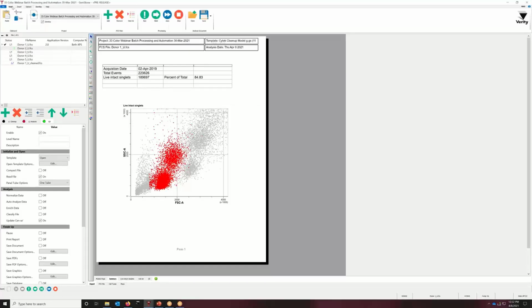You can also use the tools up here. You can designate a starting place in any number of these locations. You can clear the flags. Again, if you've done an analysis previously, all of these will have flags.